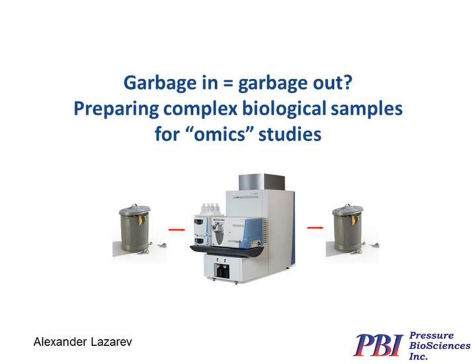Thank you, John. The topic of biological sample preparation is vast and most certainly cannot be adequately covered in a short webinar. Our goal today is to discuss the general approaches and introduce the audience to several successful examples and new trends in omics sample preparation. In the past several decades, enormous investments were made to achieve unprecedented resolution and sensitivity of analytical instrumentation for life science research. However, only in recent years, biological sample preparation had attracted attention of research groups and life science tools companies, resulting in successful development of a broad range of tools. As our analytical capabilities continue to improve, however, new challenges in sample preparation are being uncovered.